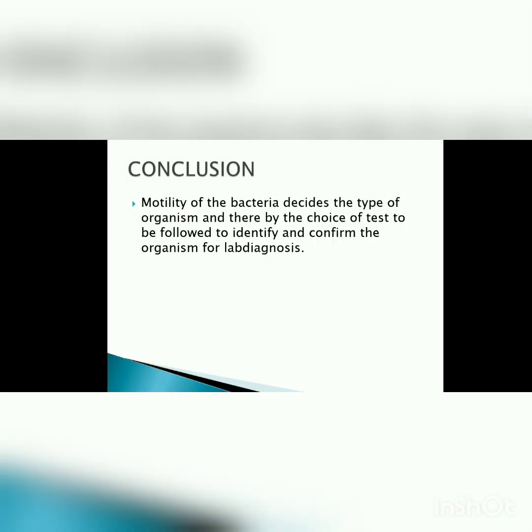Conclusion: the motility of the bacteria decides the type of organism and thereby the choice of tests to be followed to identify and confirm the organism for lab diagnosis.